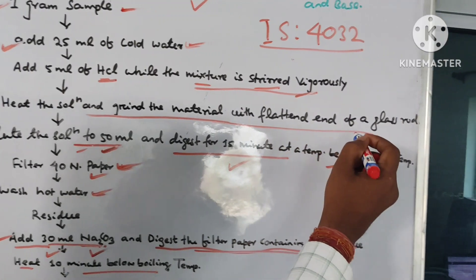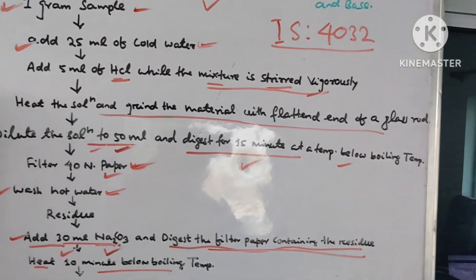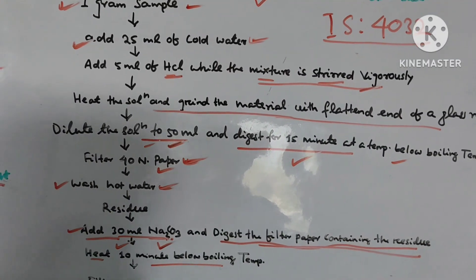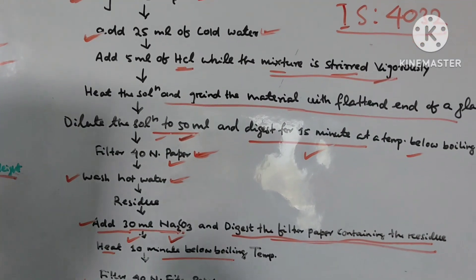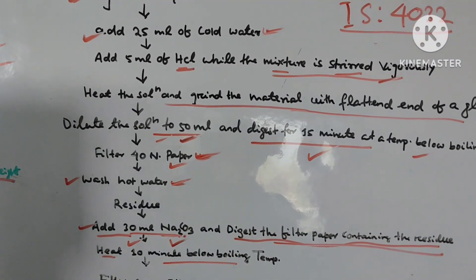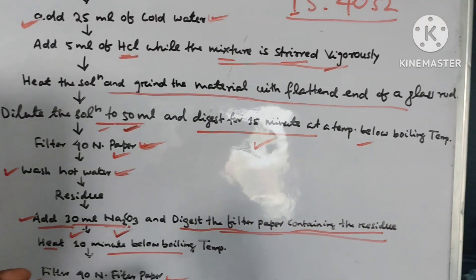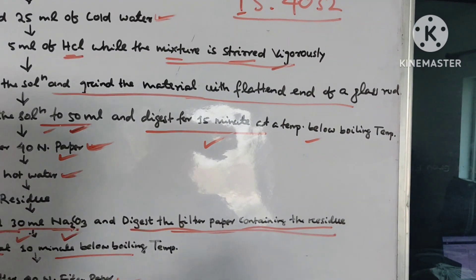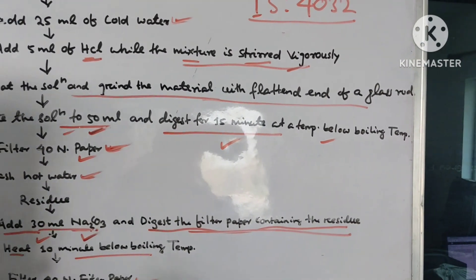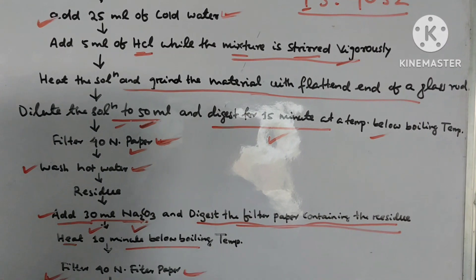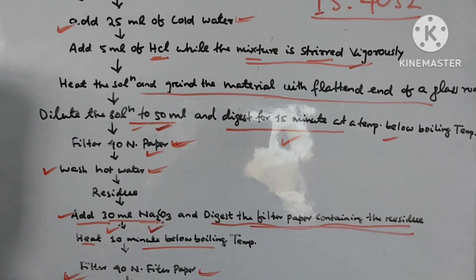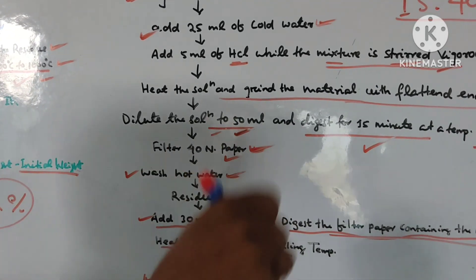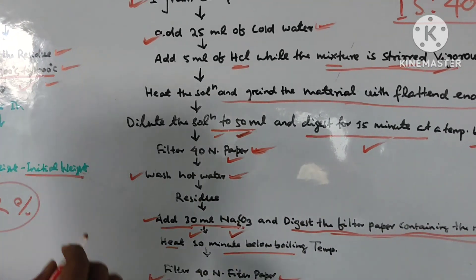Then heat the solution and grind the material with the flattened end of a glass rod. Suppose we are taking the sample of clinker - there may be small and big size particles. You have to break and grind the particles using the flattened end of a glass rod. If the solution is properly mixed, the result will be perfect.